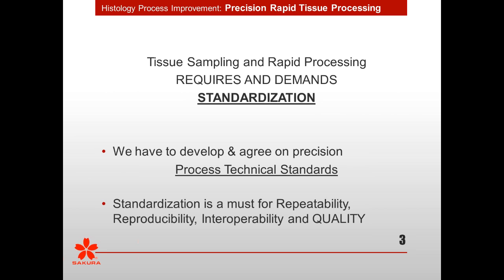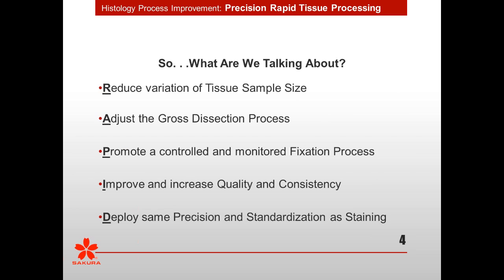That means that if I create a result, you create a result, anyone creates a result, we don't have to go through the process of recreating that result because the stain is a little different or the processor is a little different. We need to get to that level.